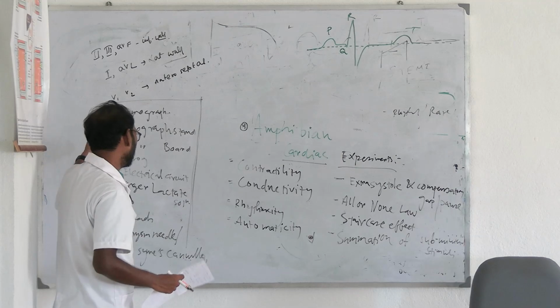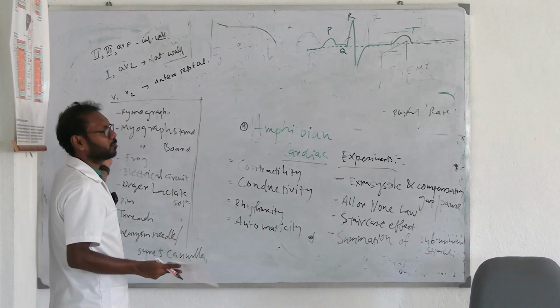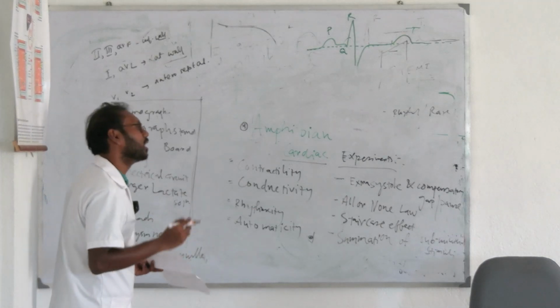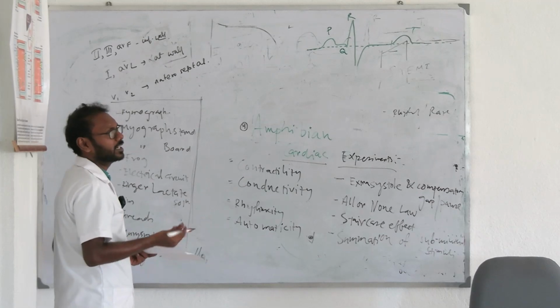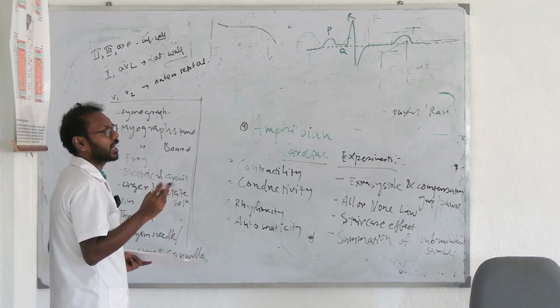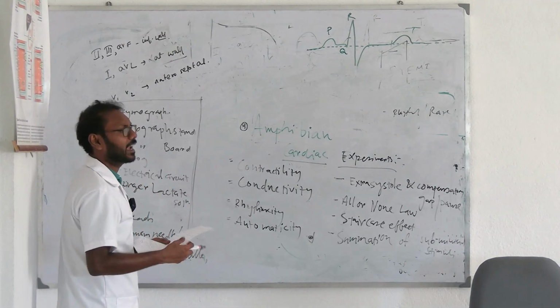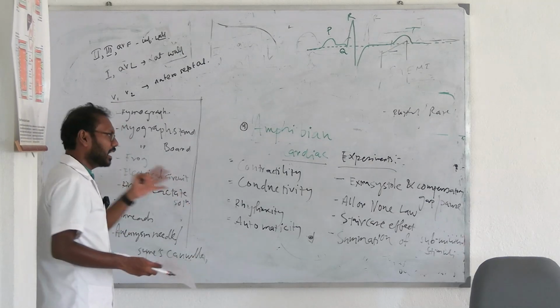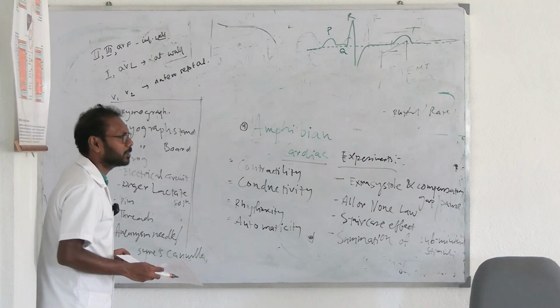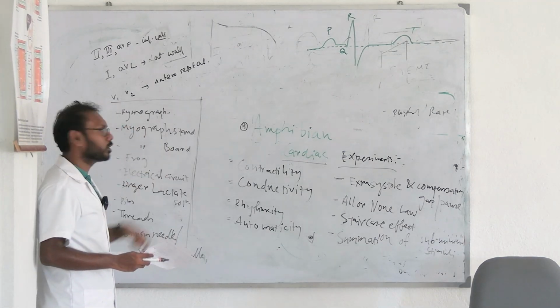So we need some basic things. Depending upon extra tests, we might be needing some extra components, like when we will be checking the drugs and ion effects, we will be needing some ion solution and some drugs like acetylcholine, adrenaline, and ions like KCl. KCl means potassium chloride, sodium chloride, calcium chloride. We will be needing those things, and a few things according to the different experiments, but primarily we need a kymograph, so that the graph can be drawn.